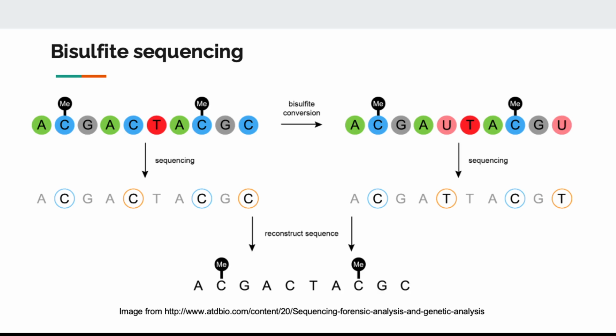Okay. Another technique that's also used a lot is called bisulfite sequencing. In this case, we want to identify cytosine that's methylated. This is important for gene regulation. If you have methylation, it can change the transcription of a gene. So we want to know, in the genome, in the chromosome, whether the promoter or the gene body is methylated or unmethylated. But in order to sequence the methylation, let's say we don't have the third generation sequencing, we use Illumina.